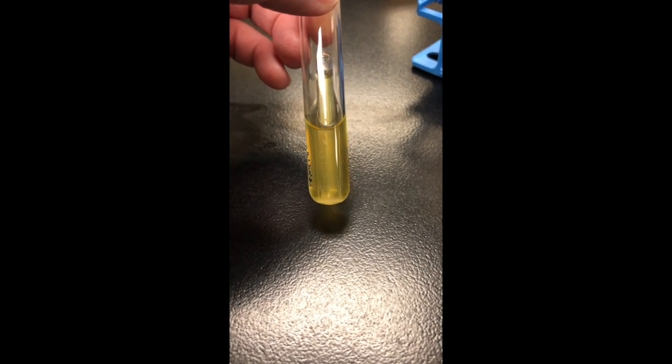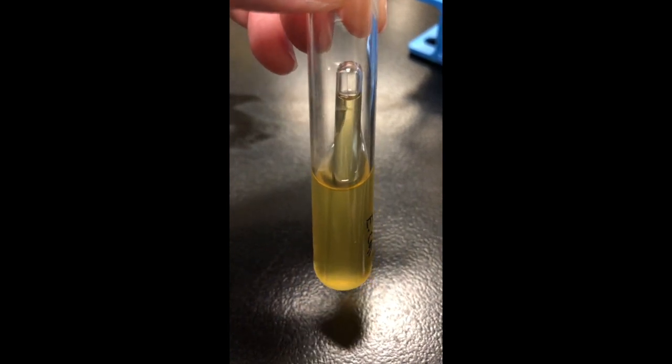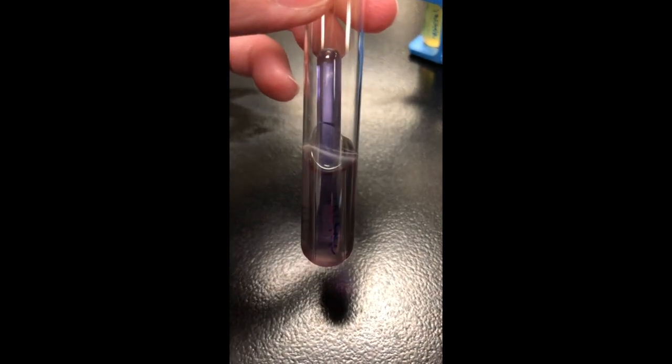Next, we're going to do the lactose test. Remember, these are purple broths where we add different sugars. In this case, our lactose test for E. coli went from purple to bright yellow. This shows me that our organism can ferment lactose and even made a little gas bubble in our Durham tube, saying that it can produce gas during fermentation. So that's pretty fun. So let's look at your unknown. What do you think?